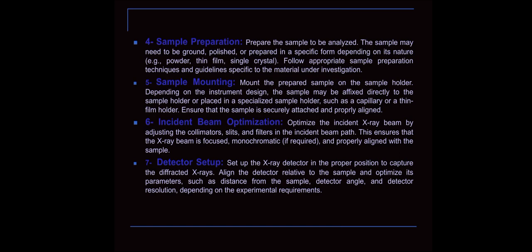Fifth one, sample mounting. Mount the prepared sample on the sample holder depending on the instrument design. The sample may be affixed directly to the sample holder or placed in a specialized sample holder such as a capillary or a thin film holder. Ensure that the sample is securely attached and properly aligned.